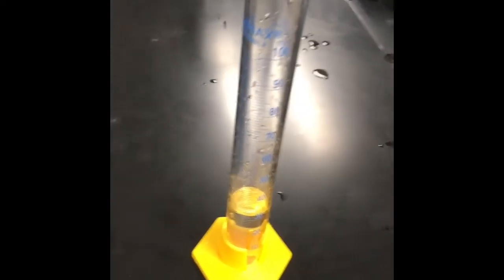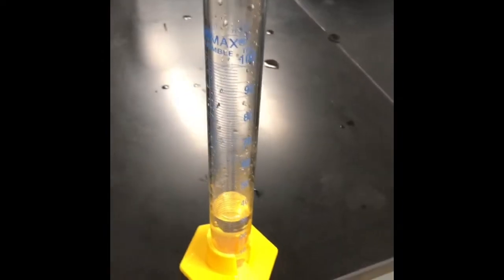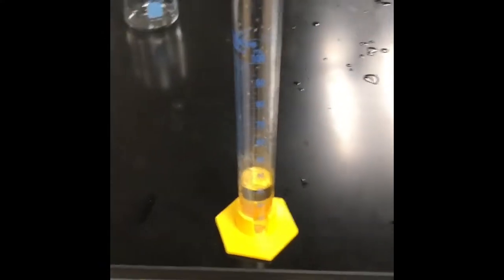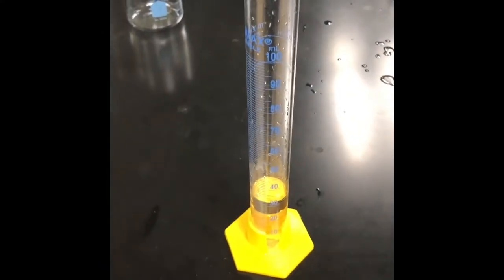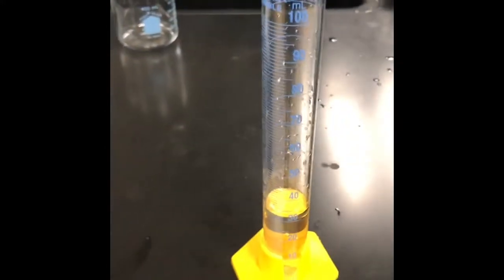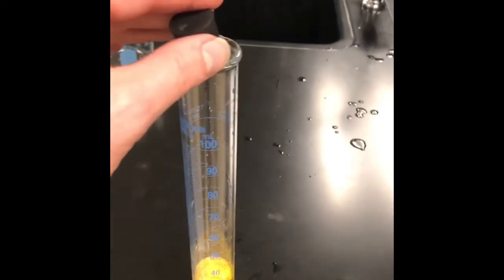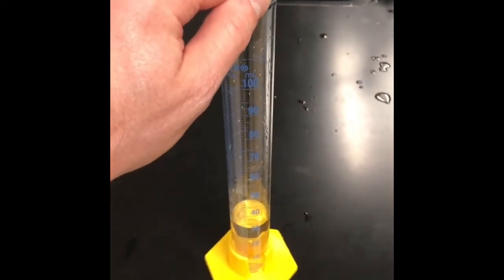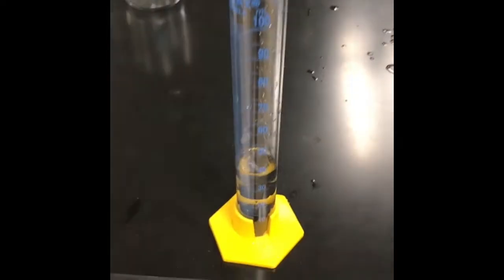Now we're going to find the volume of the stopper by water displacement, okay? Whatever the amount the water goes up to, minus the initial amount of water, which we had about 31 milliliters, is how we find the volume of the stopper. We do this for any sort of irregular shaped object. And we're going to see what it goes up to now.